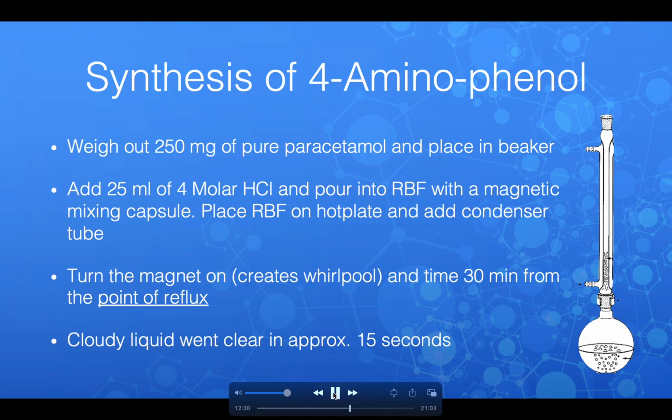Although it was ultimately a failure, I did want to share how we did plan on synthesizing 4-aminophenol. Initially we thought that the lab didn't have any para-aminophenol on hand. Hence we decided to synthesize our own using a paper by Dixon and Patel, which is referenced in my final paper, in an effort to determine the decomposition products in the filter cake.